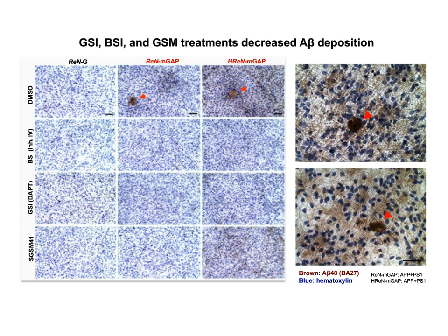In high resolution pictures, you can appreciate definitely these aggregates are not inside the cell. They are generated from the outside. Also, inhibitors of A beta, the beta secretase inhibitor and gamma secretase inhibitor, completely block the development of these brown signals.